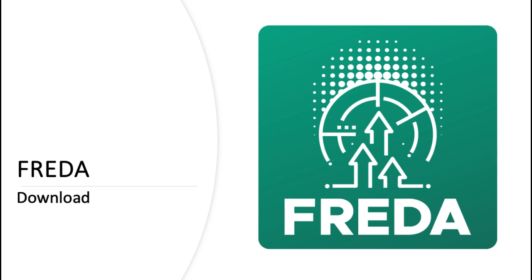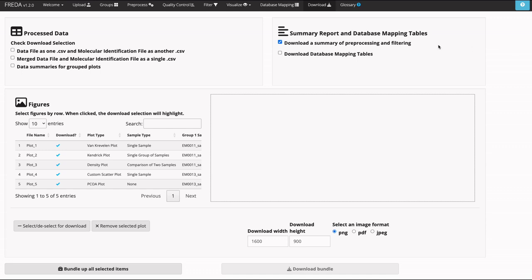Once you've pre-processed, filtered, and made plots of your data, you can download CSV summaries of all your processed data, a summary report of your pre-processing steps, and any plots you've made. First, for your data, you can download separate files for your data file and molecular identification file, a sheet that is these two files merged together, and any summaries for group plots that you might have made.